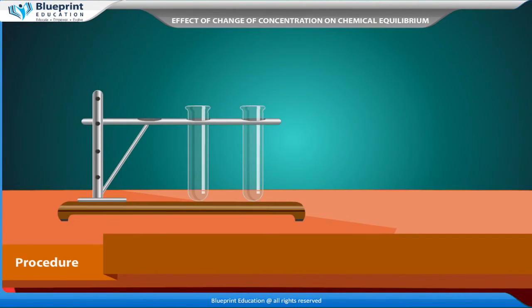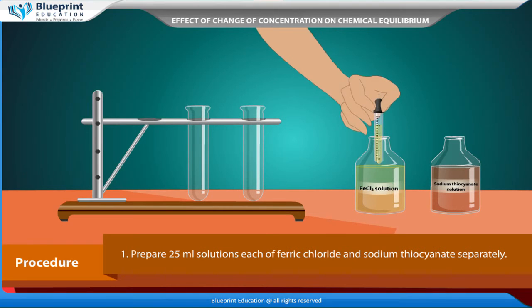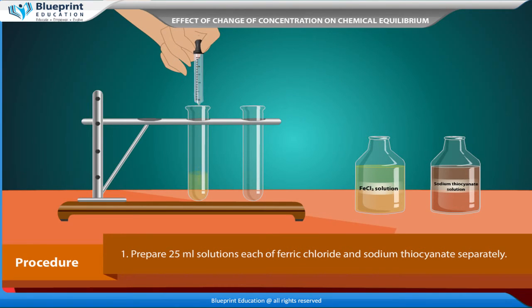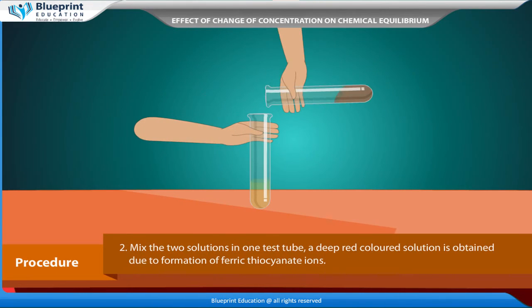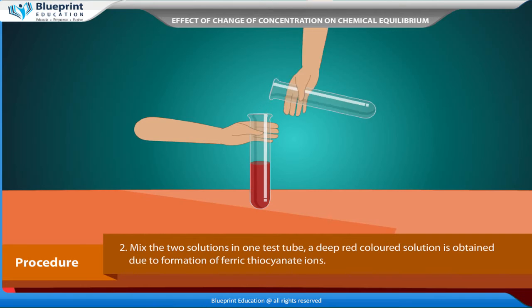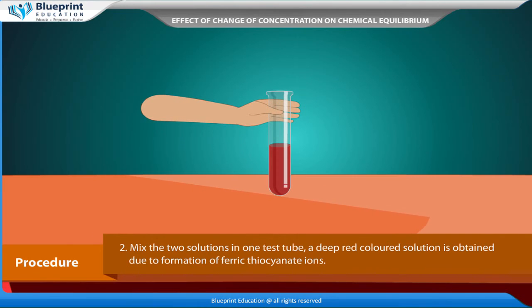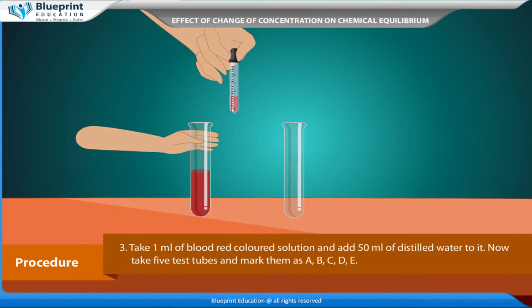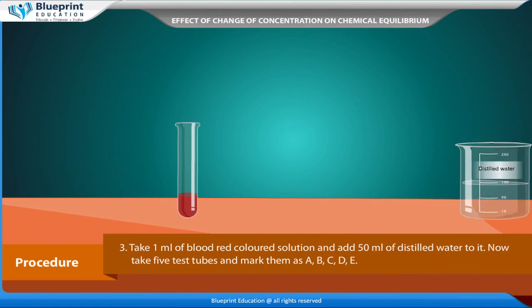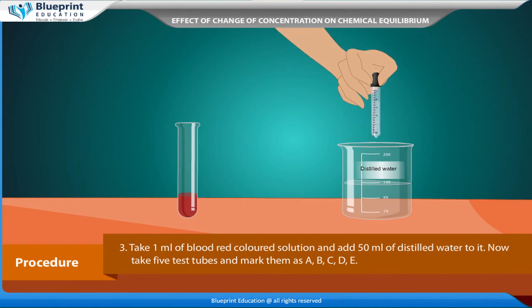Procedure: Prepare 25 ml solutions each of ferric chloride and sodium thiocyanate separately. Mix the two solutions in one test tube. A deep red colored solution is obtained due to the formation of ferric thiocyanate ions. Take 1 ml of the blood red colored solution and add 50 ml of distilled water to it.